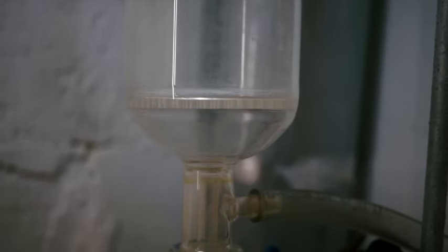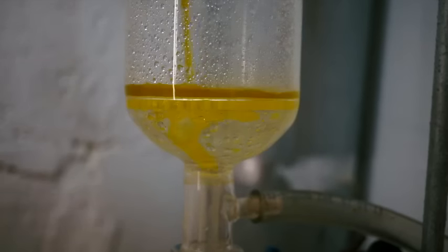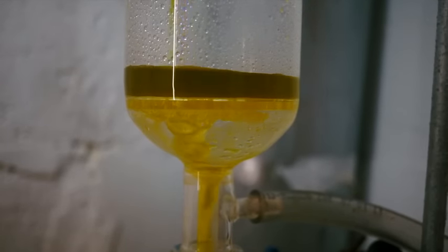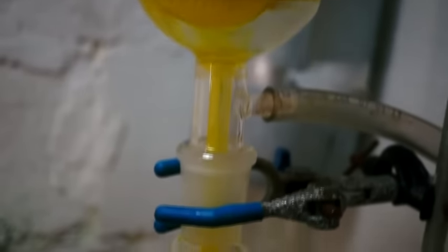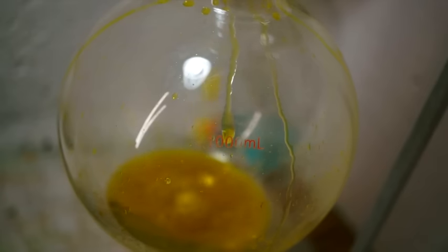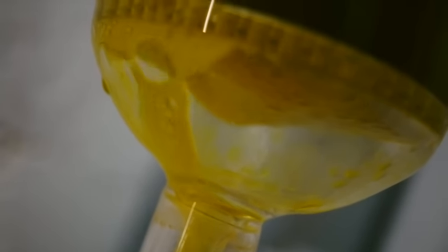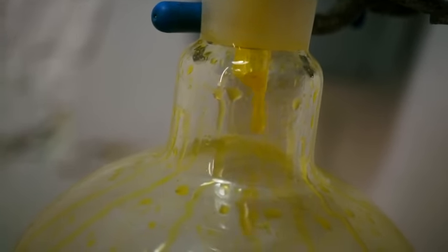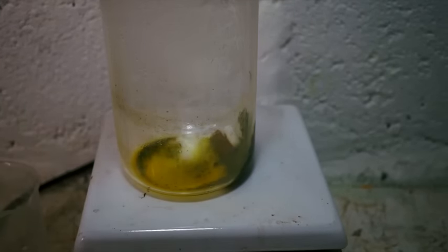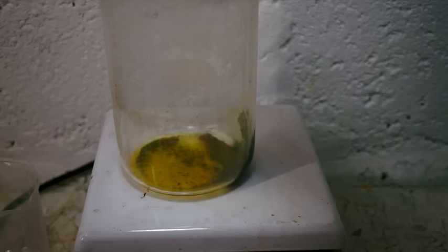We will now set up for a vacuum filtration to remove all remaining bits of fiberglass and plastic. Be sure to thoroughly rinse your beaker or container, as this contains gold-bearing solution.